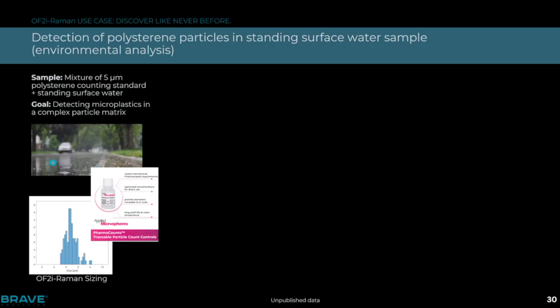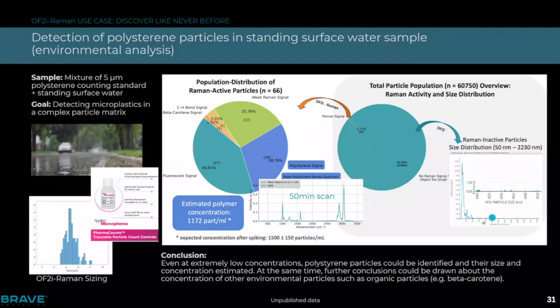So we went downstairs and took some soil, or water clearly contaminated with soil and different other components. We knew that this sample has polystyrene again, at a clear concentration. And when we measured the particles, we first of all saw that, taking this sample, lots of other particles are in there.